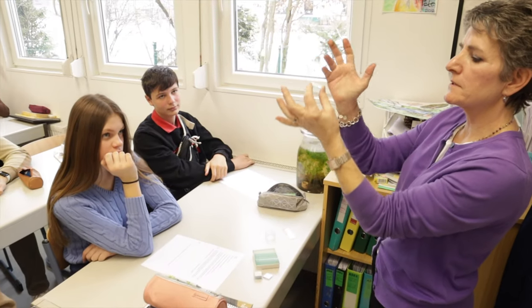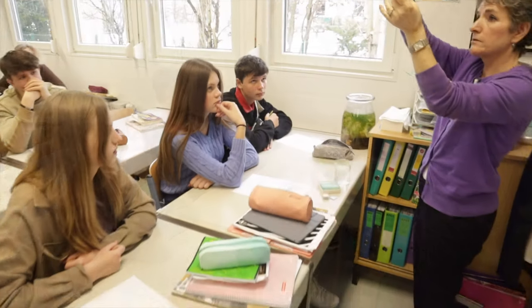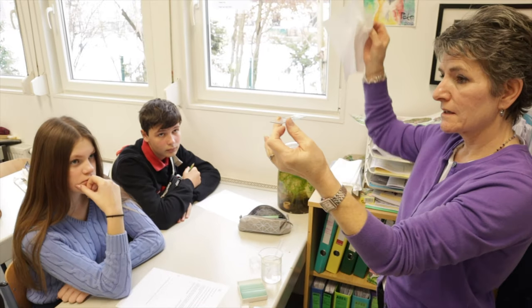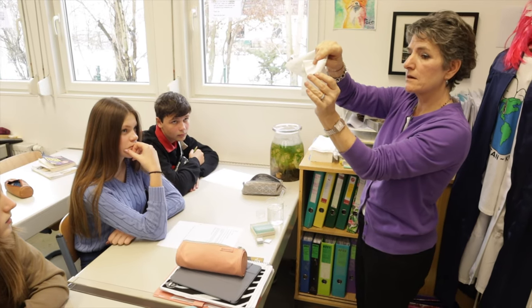Take the cover slip and drop it on the slide, covering your leaf. Then look at it under the microscope. Add a few drops of this salt solution, tilt the slide, get a paper towel, and put it at the opposite edge — it will draw that salt water across.